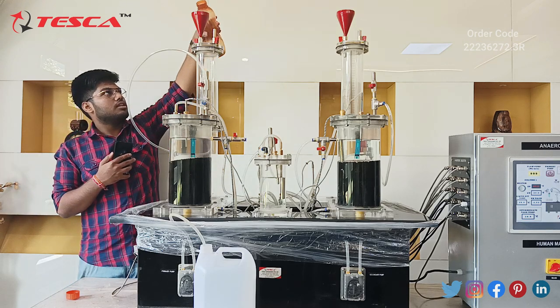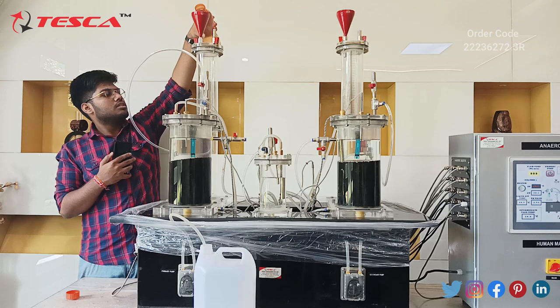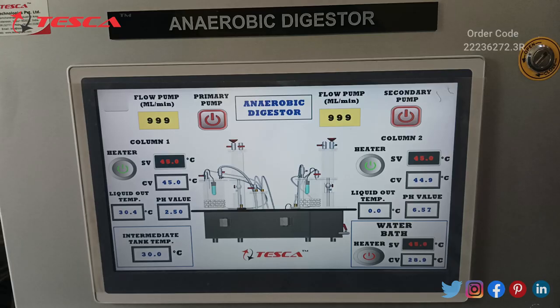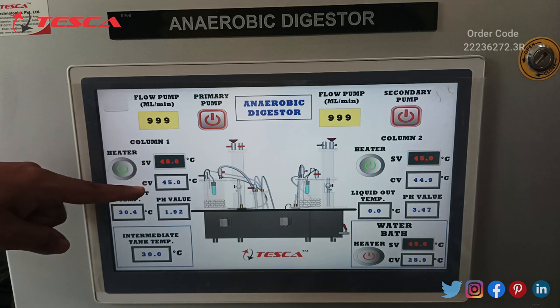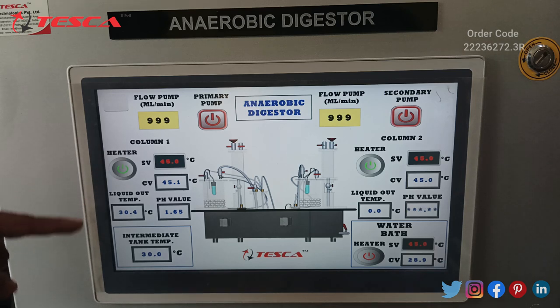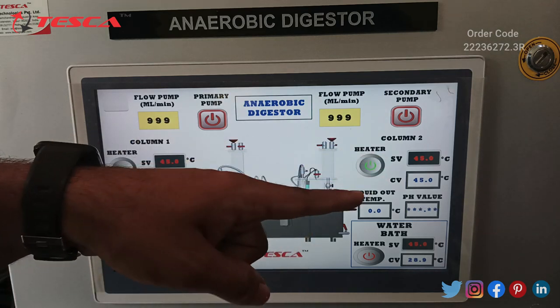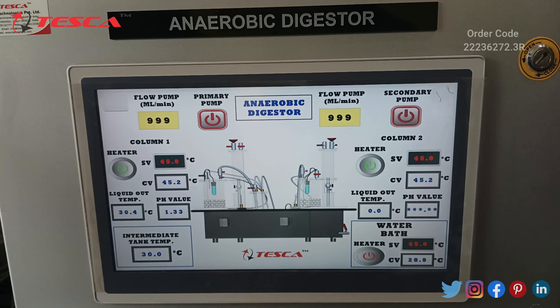As we can see, column 1 set value temperature is 45 degrees Celsius and the current value temperature has also reached 45 degrees Celsius as the heater is on. Similarly, in column 2, the set value and current value temperature are both 45 degrees Celsius and the heater is on. Now we will open our gas valve so that the gas from column 1 and column 2 reaches gas collecting tank 1 and gas collecting tank 2 respectively.